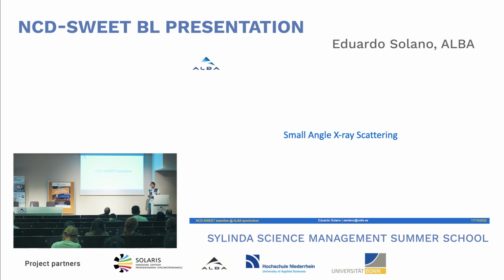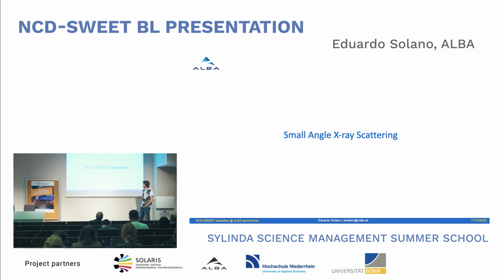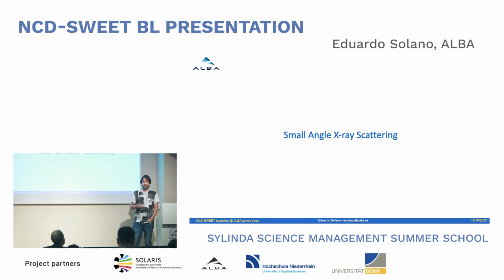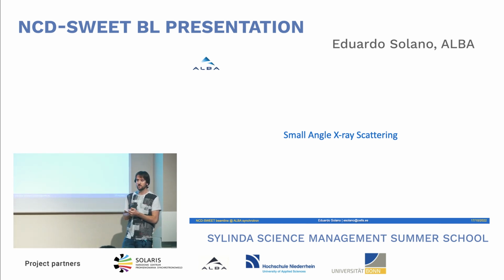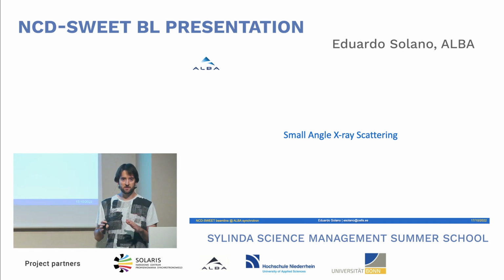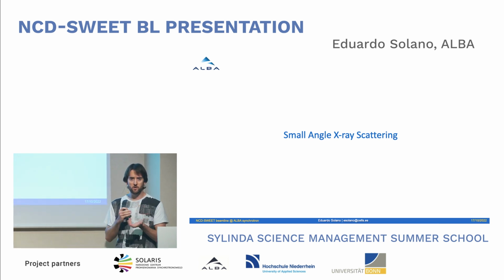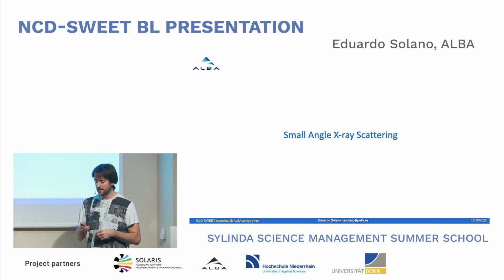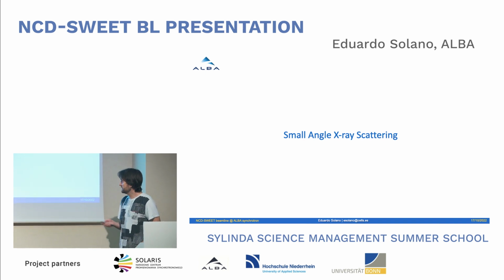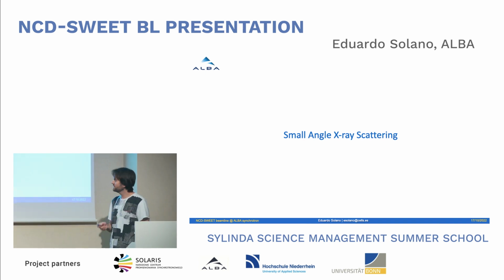So a bit of introduction about the scattering technique. Then I will go through the beamline itself. You will see it later this afternoon, so I'm not going to really lose time on this. And since you are coming from different fields, I will try to give you some overview of what we can do at the beamline, different types of experiments, different kinds of setups, and different kinds of information that we can obtain. So let's start with the small angle X-ray scattering.